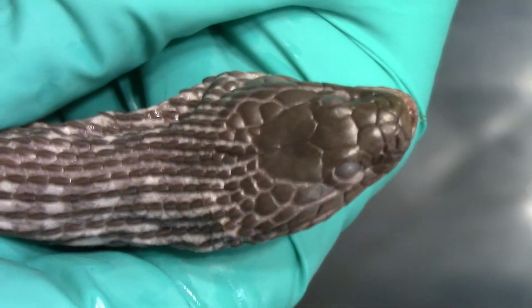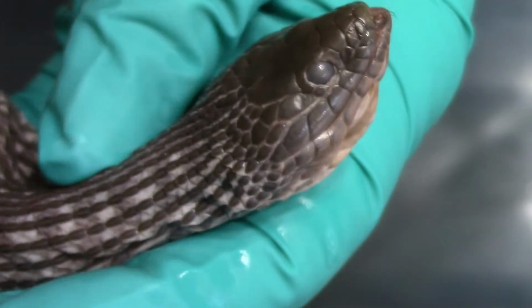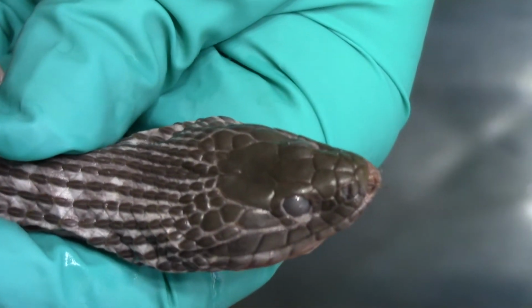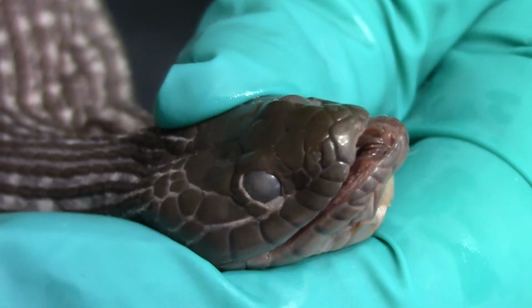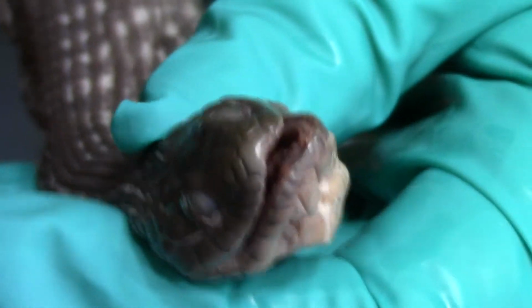If we look close up at our specimen's head, you can see that the scales start to have some patterning, and when you are trying to ID snakes, knowing the patterns of their different skull scales becomes important. On this guy you can see the two nostrils at the front of his nose and his eyes, but he doesn't have any pit organs because he's not a viper.